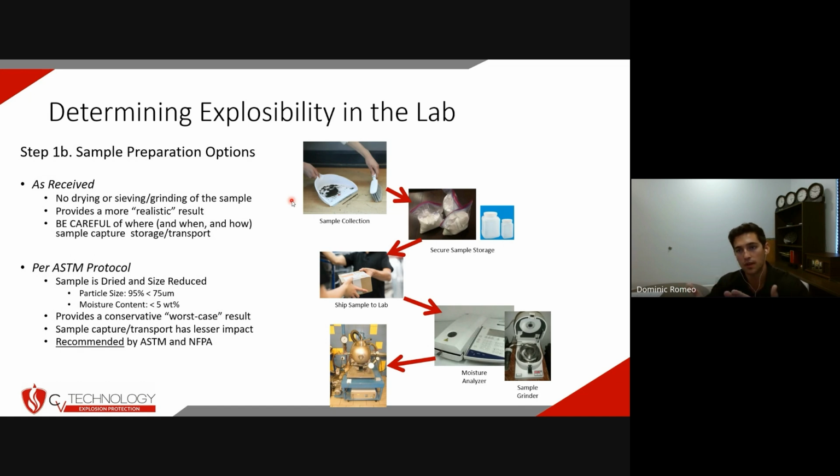And two other steps to keep in mind here are going to be as received or per protocol. And these are two different ways that this dust can be tested. So as received is exactly how it sounds like. It's as the material was sent to us. If you put it in this bag, we're going to test it exactly like that.